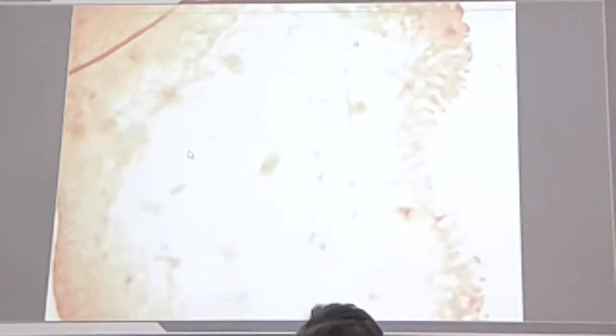Okay, our next section is the stomach. Here is a section taken from the stomach, let's say longitudinally, and I can observe the surface on the right side, at the tip of the arrow, and I can observe the serosa and the other tissue elements on the left.